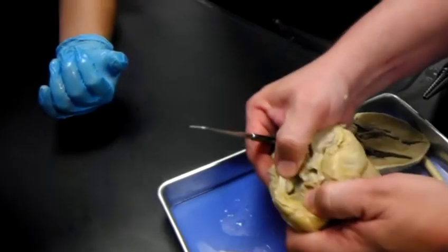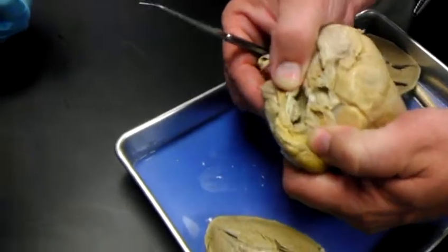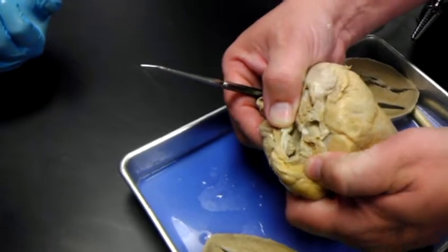And then back here, where the left atrium was, that's why I was saying good luck finding pulmonary veins there. It's just a big, giant, open gash.